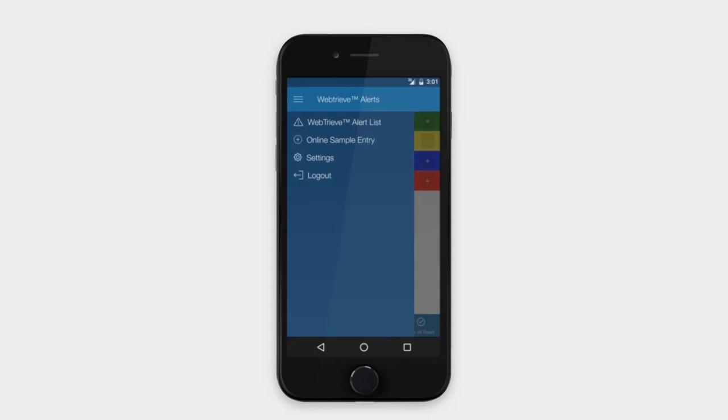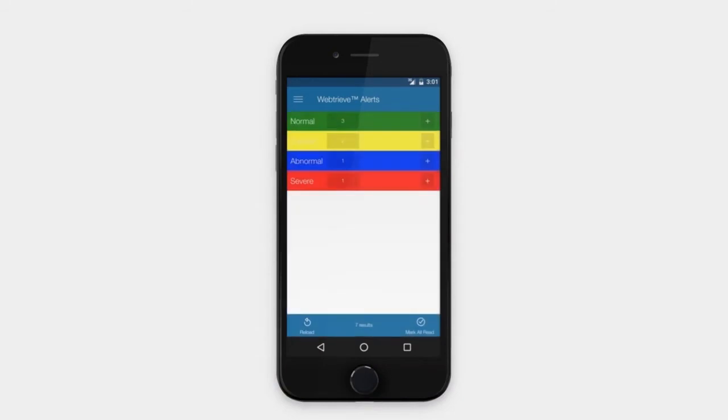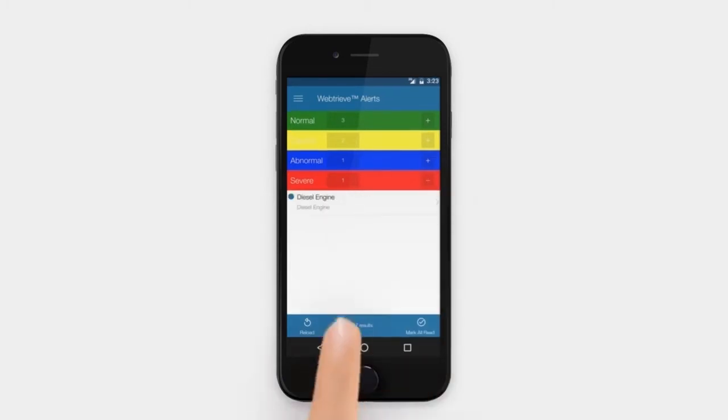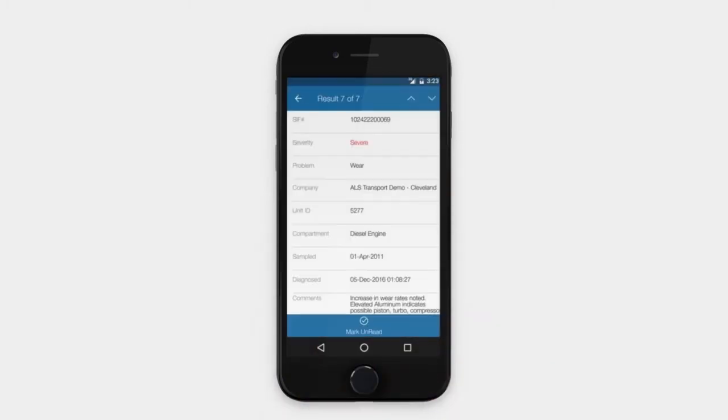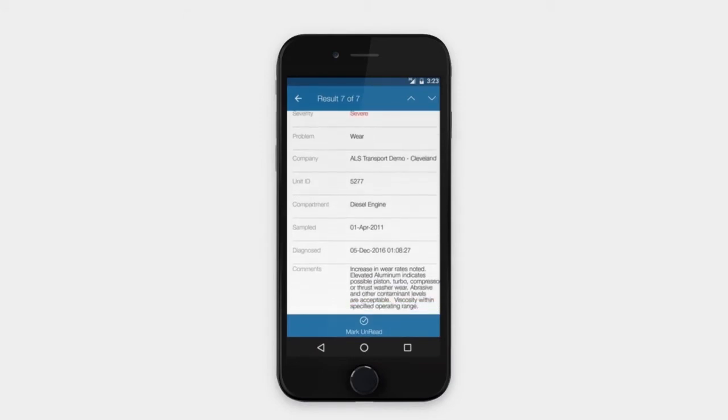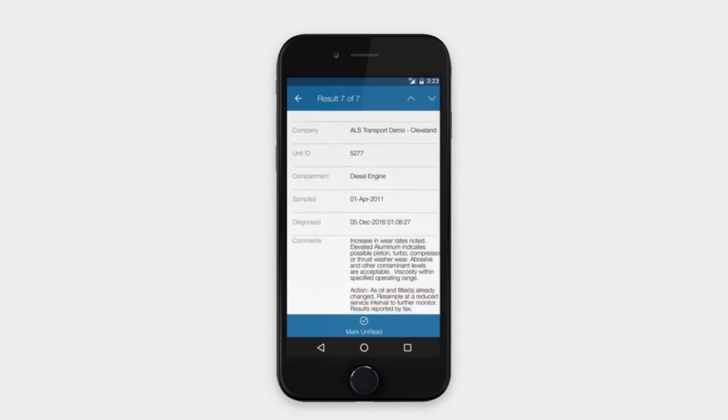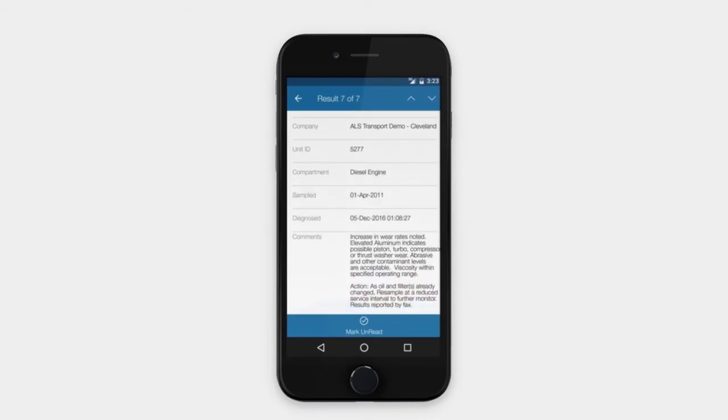When you select WebTreeve Alert List from the menu, you will see a listing of your sample alerts grouped by overall condition. You can select any sample on the list to view sample details such as the unit ID, compartment, and sample date. The alert will provide the overall condition and the diagnostic commentary related to the sample alert.